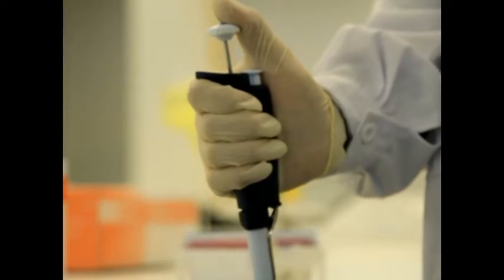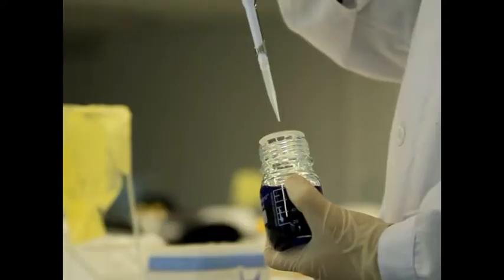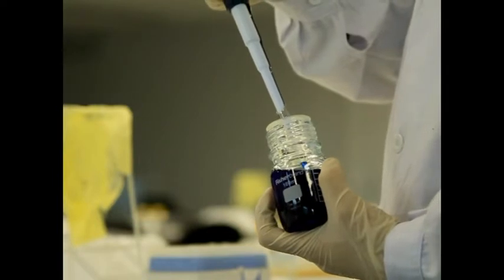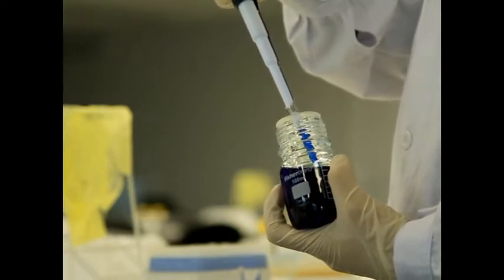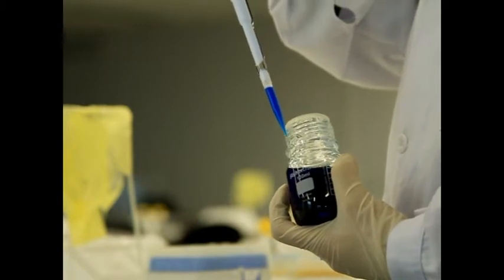The push button is first pressed to the first stop, and this expels a volume of air equal to the selected volume of liquid. Aspirate the sample and release the push button slowly to fill the pipette, and not have the sample rush into the shaft and cause contamination.